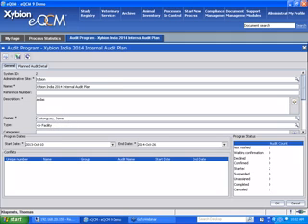Who's the owner of the program, put in a description, a name, and then you build the various audits that you want to do. If there are any conflicts, they'll show up down here. And so it also shows you notifications. So as you build them, you can send notifications that quarterly inspection was scheduled for this date. You can require those auditors and inspectors and auditees to confirm that they'll be available for the audit. They can decline. So that's what this waiting for confirmation, declines, confirm. This is really more for planning something like a site inspection. It wouldn't really be for an ad hoc study inspection.